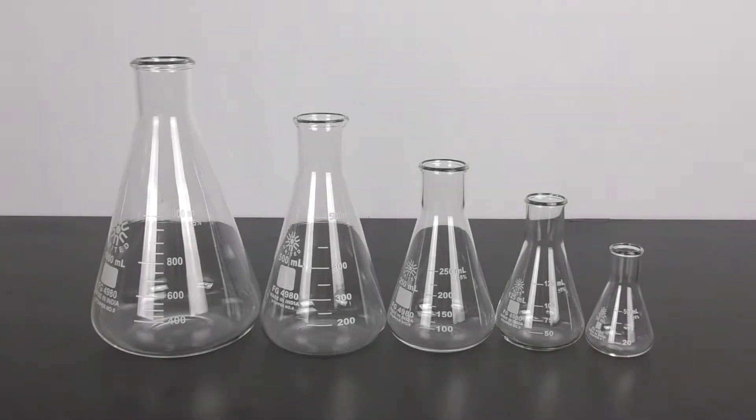The Erlenmeyer flask set is a perfect way to obtain a variety of sizes that you need for your experiments, whether you are starting up a new lab or just need a good replacement set.